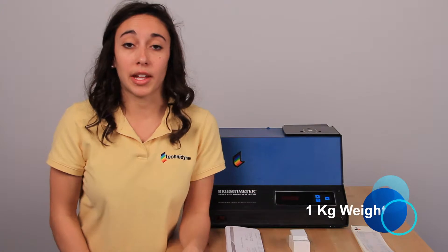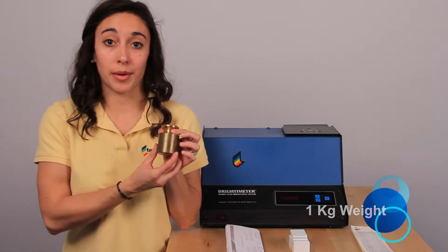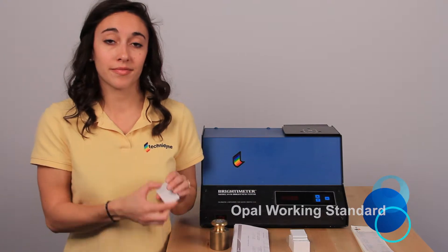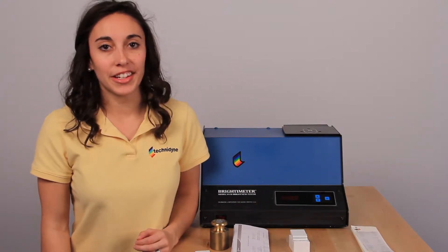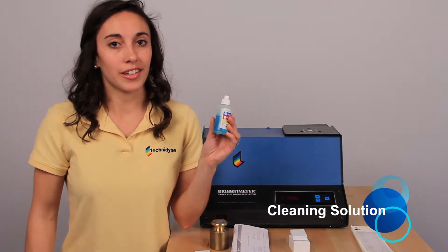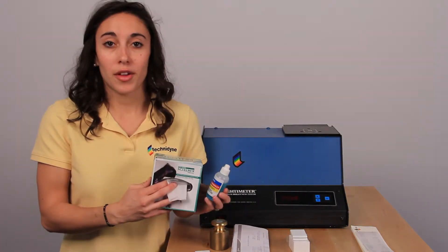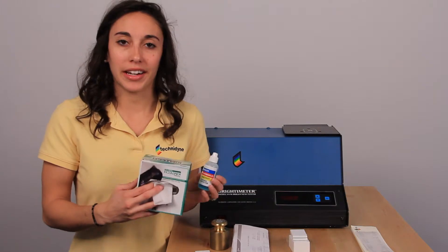The next thing that you should have, which came with your instrument, is your one kilogram weight. You'll also need an opal working standard. Finally, the last thing that you'll need is a cleaning solution and a non-abrasive, non-optically brightened cleaning wipe. Once you have all these things together, we're ready to go ahead and get started.